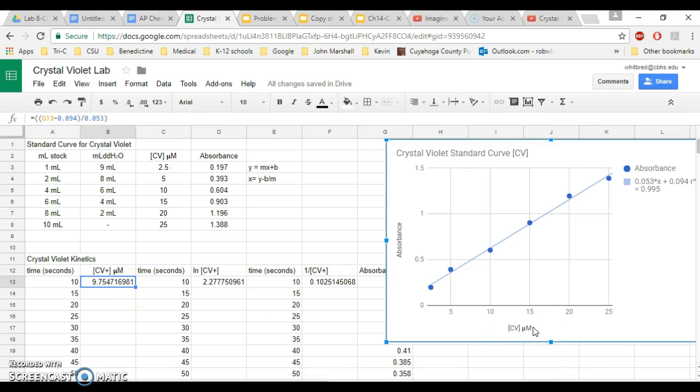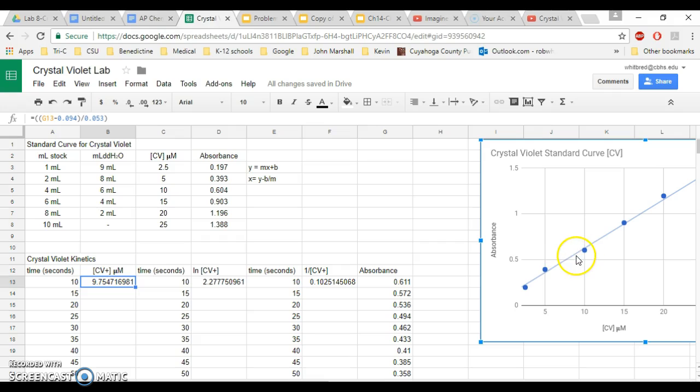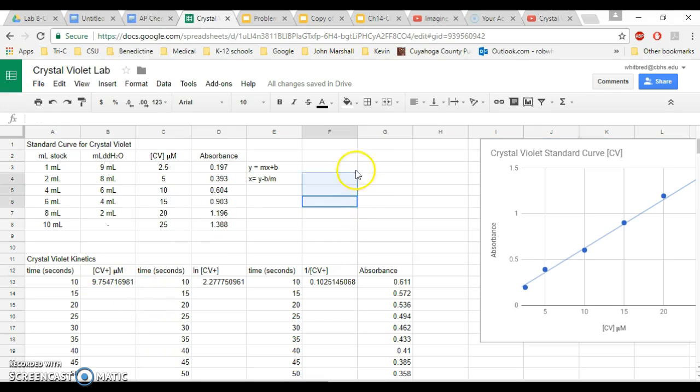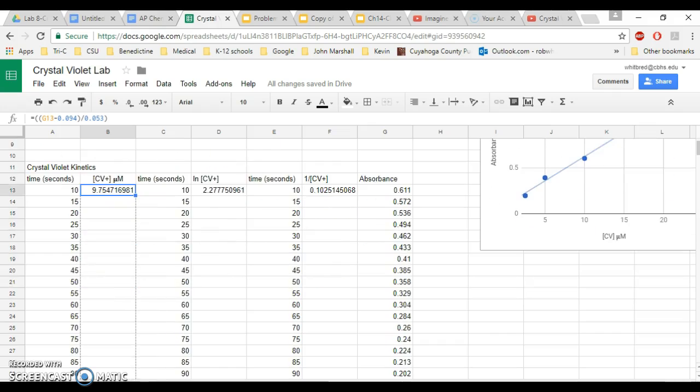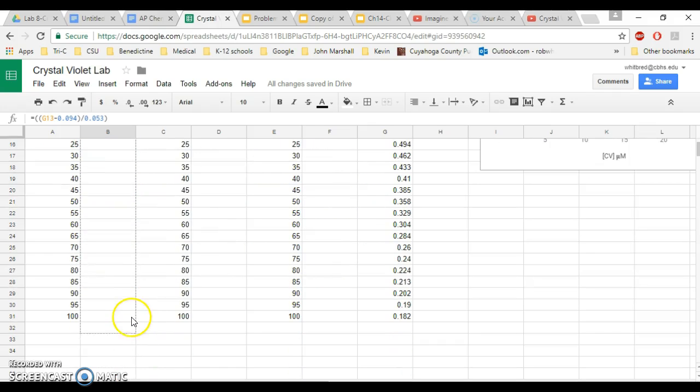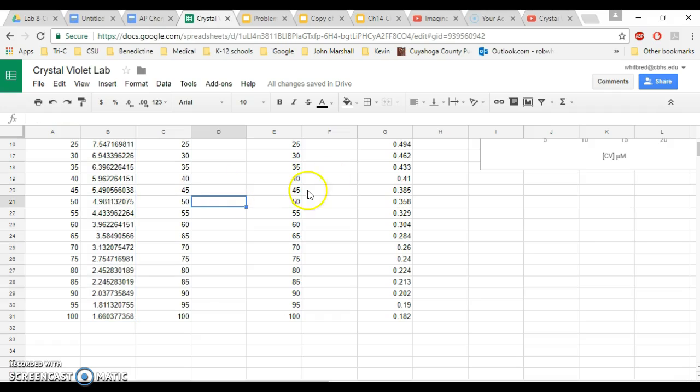So you're going to want to look at your graph and you're going to want to say, okay, the absorbance over here is 0.611. So if I go over here and I go 0.611, I'm going to be pretty close to 10, which is what I've got. And that's exactly what you have. So that means you've set it up correctly. So now, in order to use this formula to calculate every concentration all the way down, all you have to do is pull the values down, and it will populate all of your data from that point on.